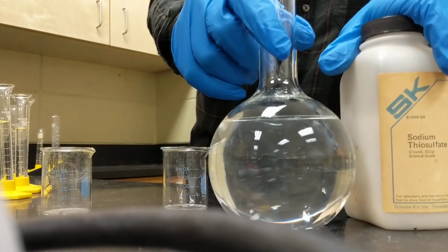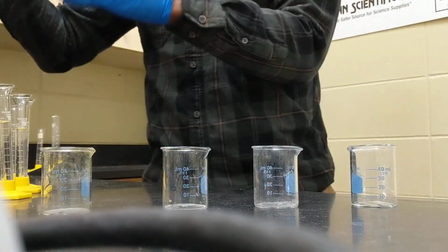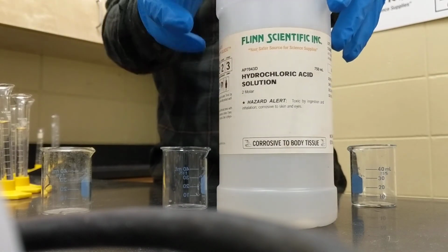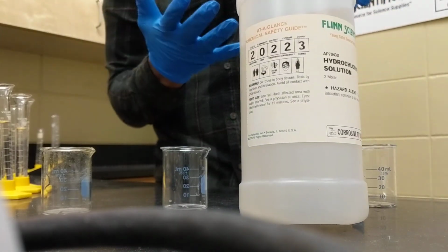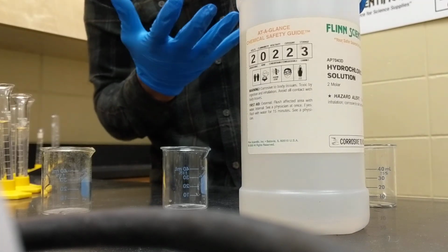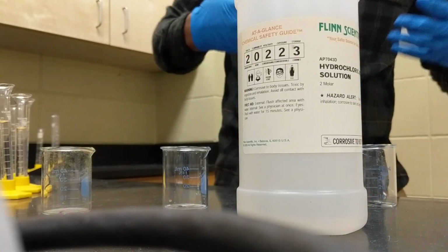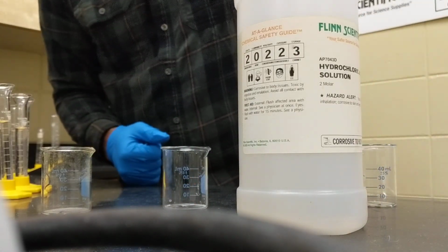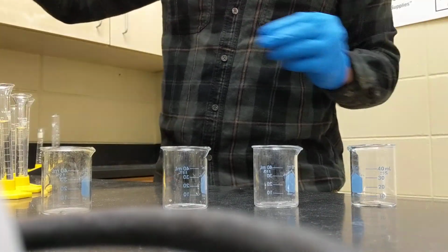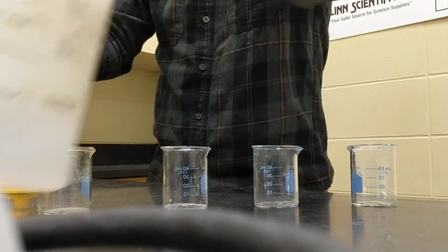So now we have this 0.15 concentration of the sodium thiosulfate, and we also have our hydrochloric acid, which is 2 molar. Now, 2 molar is enough that you want to wear gloves and exercise caution because it has a little bit more bite than the typical hydrochloric acid that might be found in your stomach that's responsible for breaking down foods.